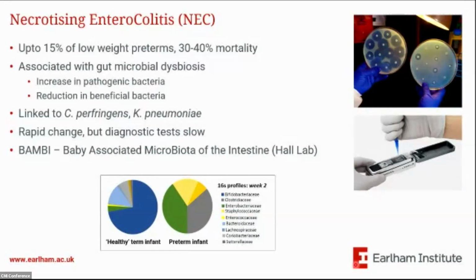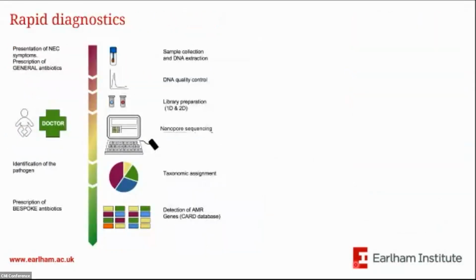So together with Lindsay and a trial she was running at the time, we wondered, could we use nanopore sequencing for rapid surveillance and diagnostics of these patients? The paper we published a few years ago has comparisons of Illumina and nanopore data, and longitudinal studies. But the thing I wanted to highlight, the most exciting thing for me, was the rapid diagnostics proof of concept that we attempted.